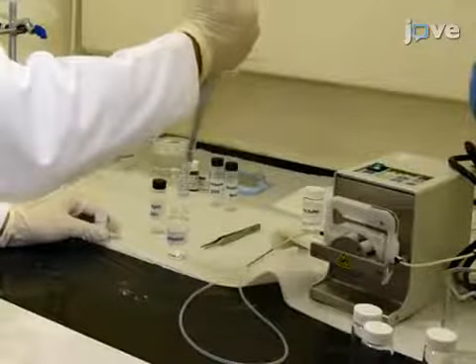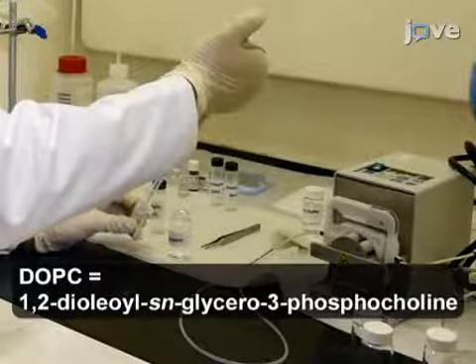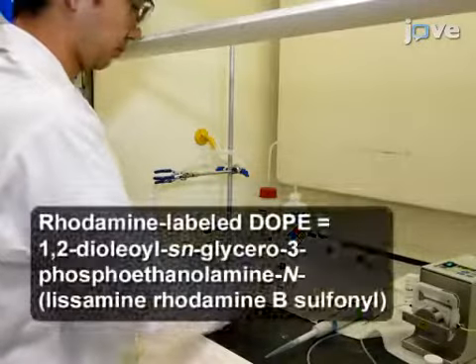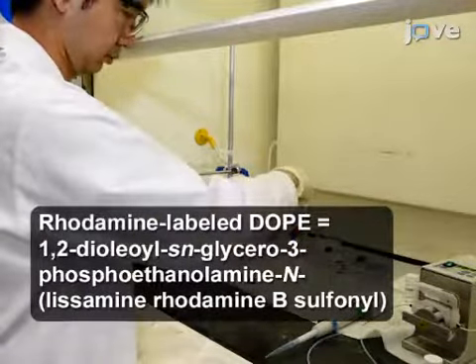Prepare a lipid stock solution of 10 mg per milliliter DOPC lipid by dissolving the lipid powder in isopropanol solution. Then, dissolve rhodamine-labeled DOPE lipid powder in isopropanol solution to obtain a lipid stock solution of 1 mg per milliliter.